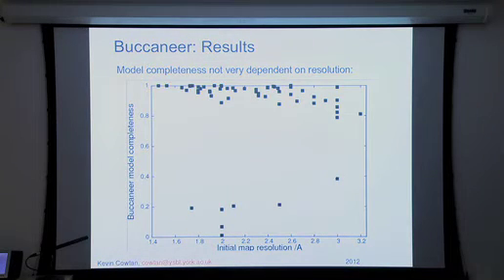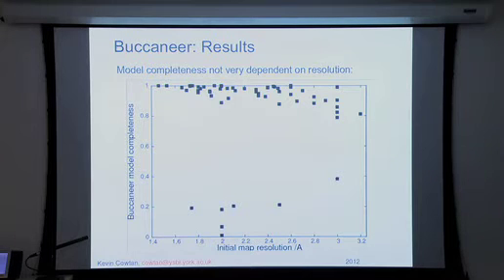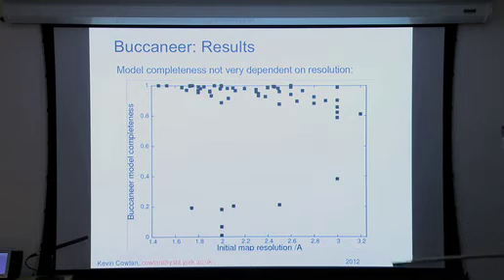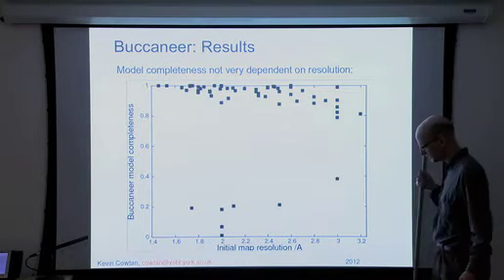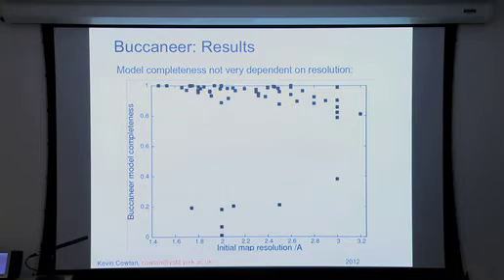So that's the basic process. Here's a little illustration of 50 structures again, which I tried this on. Resolutions 1.4 to 3.2. Some of them it built the whole lot. Even at 3.2, it managed 80% of this one. We've seen successful structures down to 3.7 angstroms, and the Leiden group have got it working down as low as 4 angstroms, but that involves some additional methods as well.